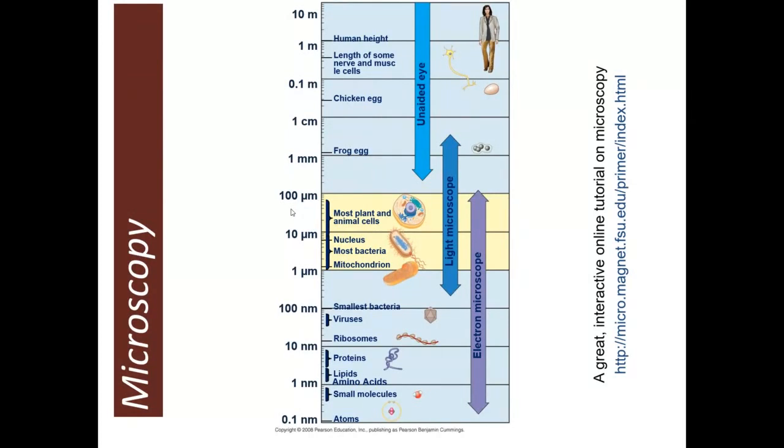First of all, hardly anybody's probably using a microscope this semester, especially because they don't want to be sharing them between students, even if they were in person. But you will get your chance. And I absolutely promise that at some point, if you maintain being a biology major, you're going to get your chance. Okay, so what a microscope does is helps us see things we can't see with our naked eye.